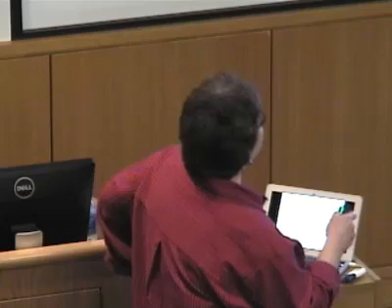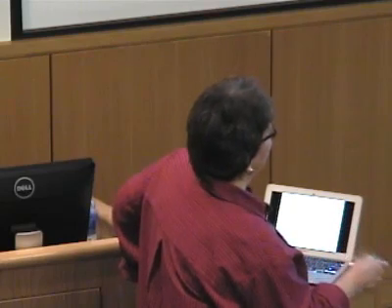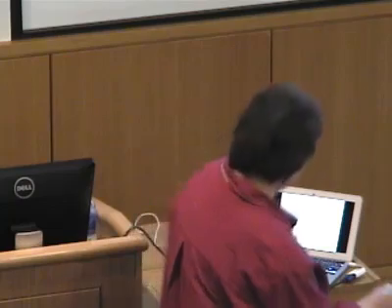So the closest match, that is the sequence that matched at the best score that had a known function, sorry, I should have spelled that out, thanks for asking, was this phosphoglycolate phosphatase. And that's what I'm showing aligned here. So, as I said, how do you tell what's important? So here's our little motif alignment that I showed you earlier.